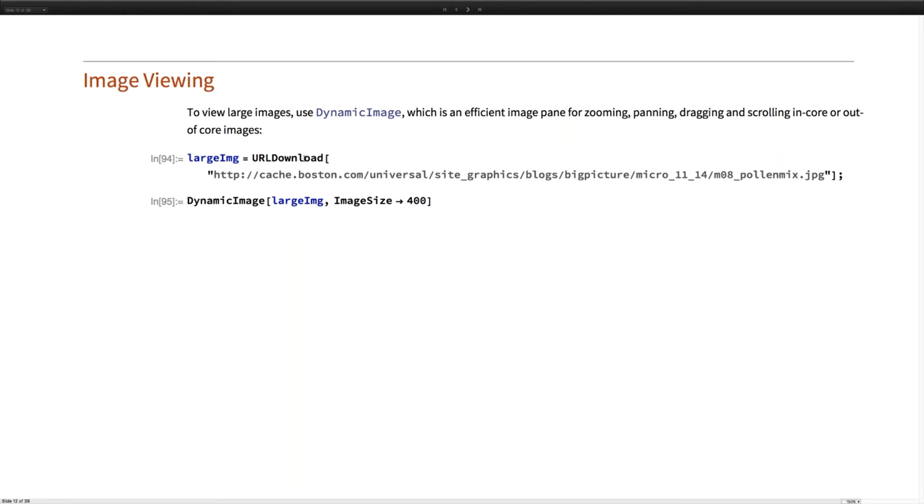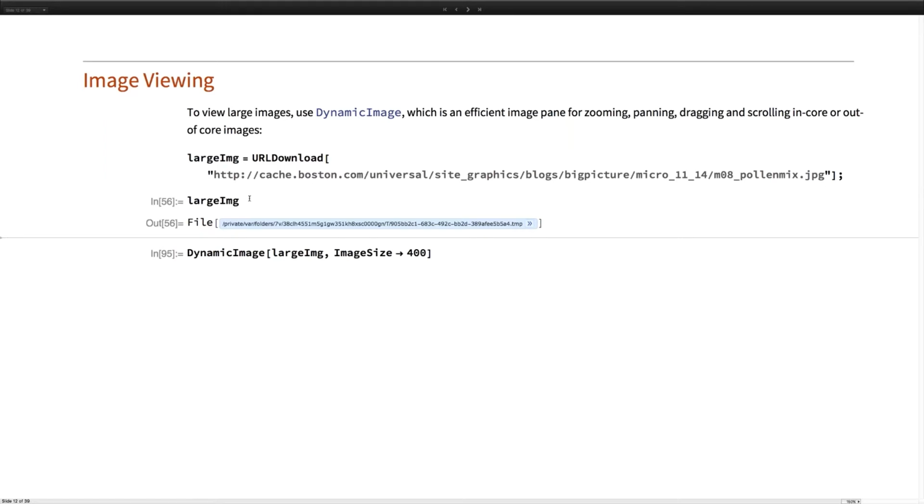All right, so once I have the image in the machine, I have pre-processed it, and I have what I want to see extracted from the image, I'd like to view it. And we have seen already that quite often you stitch images that are by themselves already pretty big into even bigger images. Well, I just load here a big image, which is not that terribly big, but it's a big image. So URL download. I'll just do an import that way.